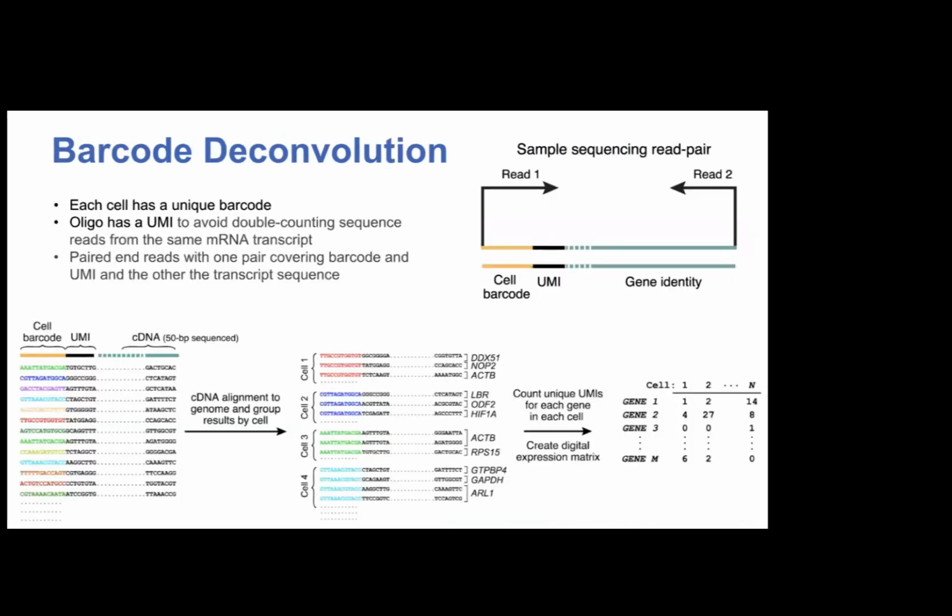Okay, so this is what this looks like. Imagine this is our FASTQ file, and then we have the cell barcode. This is just a sequence, and it is now synonymous with a cell. If we see this sequence again, then we know that these reads, whatever comes afterwards, are from the same cell, right? So the first step of the algorithm would be to find the barcode, then find the location of the sequence on the reference, and then allocate the count to the gene for that cell. Right, so this is exactly how this works.